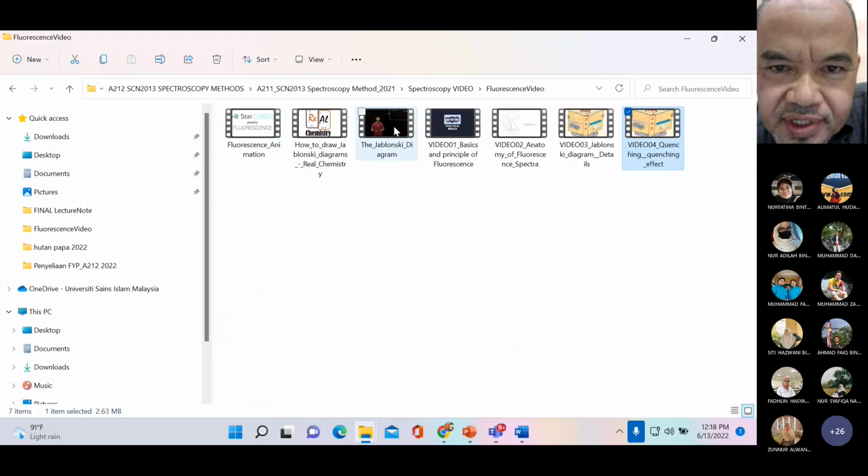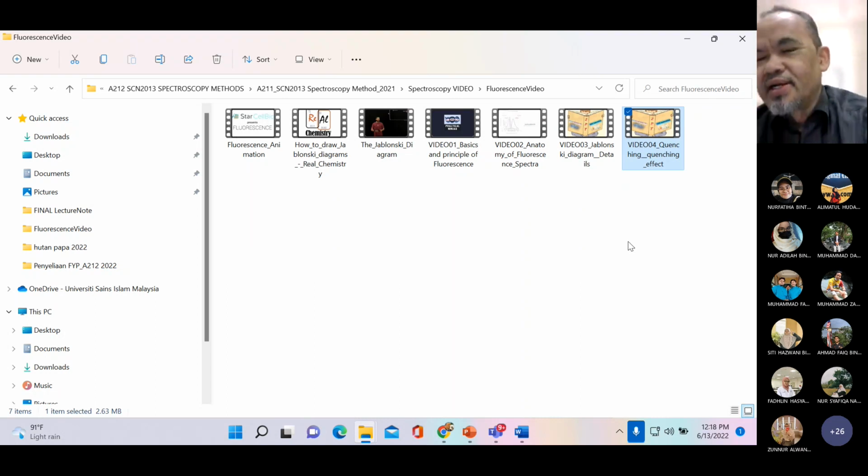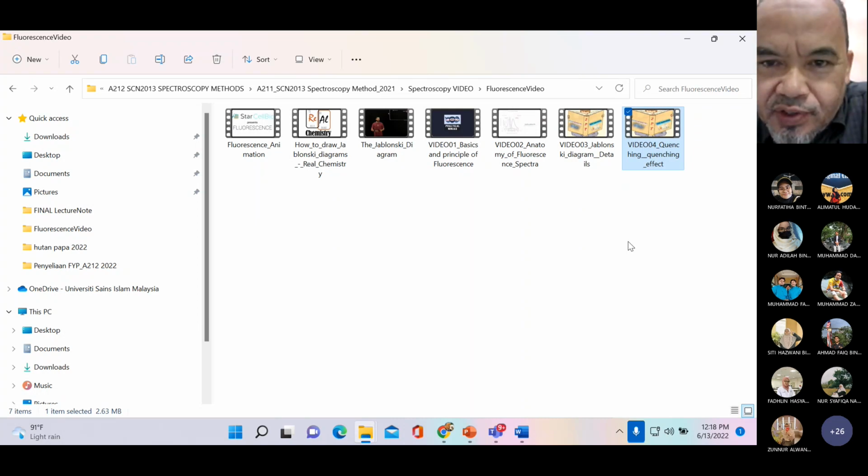Actually, I have shared 7 videos with you altogether. Hopefully, during your spare time, you will allocate some time to go through them. I want to go to the basic principle of fluorescence first, just one video. Please have a look and try to focus, and then we discuss afterwards.